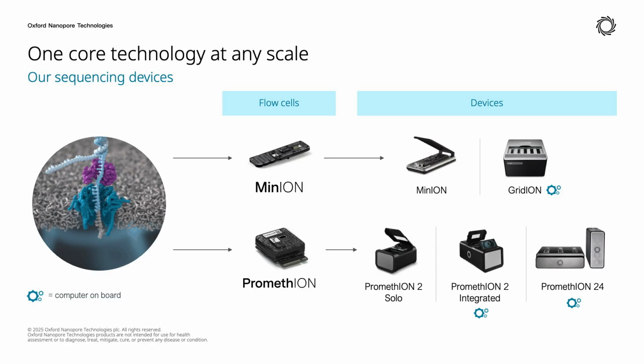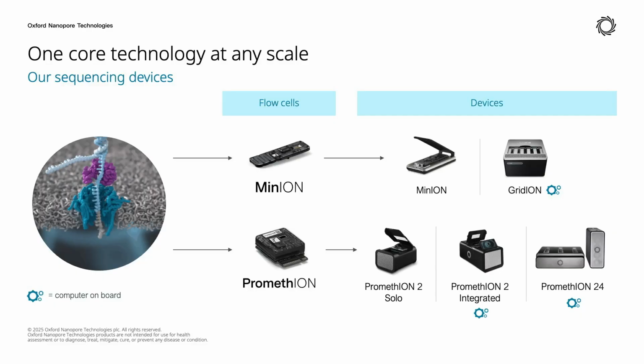Solo that can be plugged into your computer or into the GridION, PromethION 2 Integrated, which is the device we will be demonstrating loading today, as well as the biggest PromethION 24 device that can accept up to 24 flow cells with 24 independent positions for PromethION.